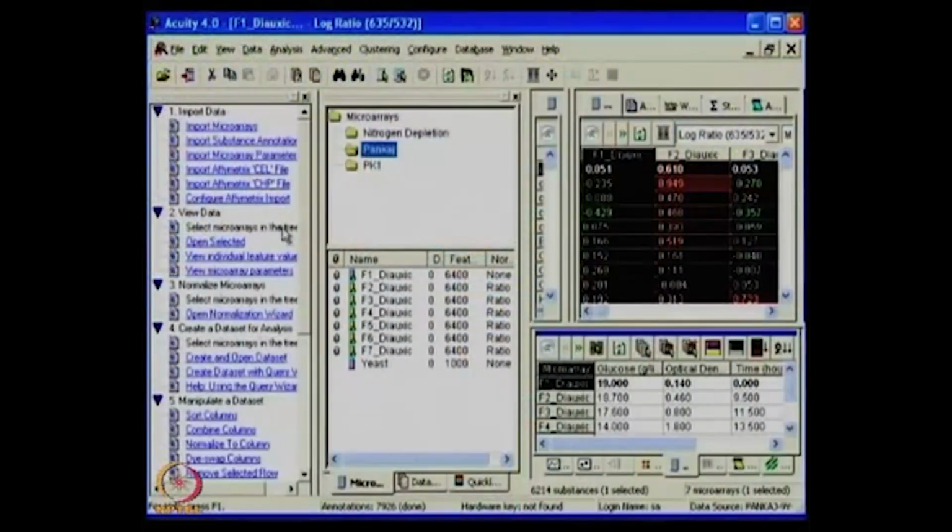As we described, we first see the import data tabs. This allows one to take the data from the microarray database and store it in the form of a GPR file and allow that to be understood by the Acuity software. We also have the opportunity of text file import, where you define what is available for what. In this fashion, I have defined in the microarrays folder the training, and it says what different slides are available to us to design.